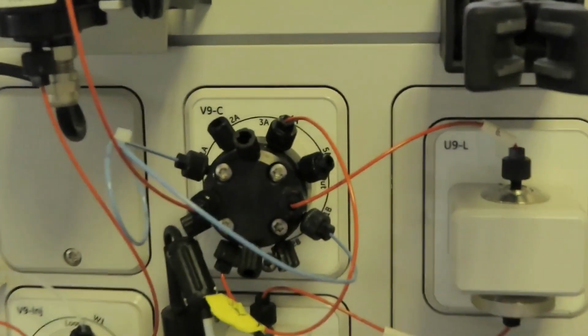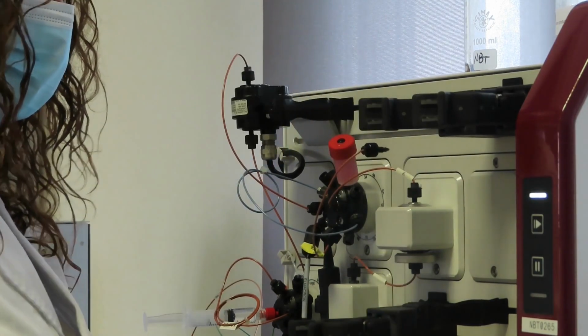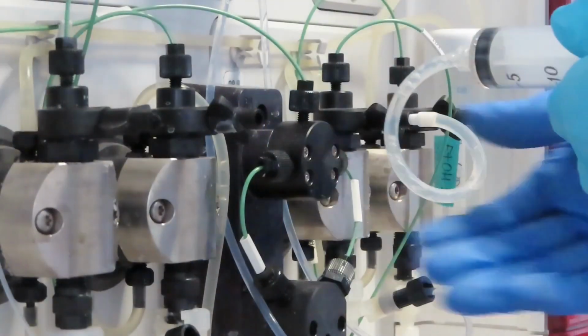The first step is to connect the chosen column to the system. In this case, a cobalt column is connected to the column valve. It's very important to be careful connecting the tubes in order to avoid the entrance of air in the system that could disturb the liquid flow through the resin.